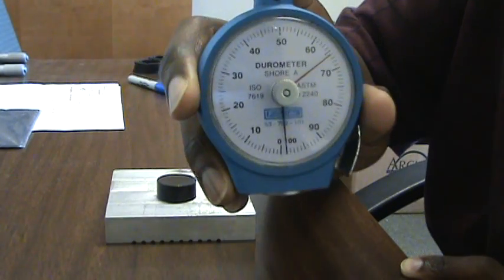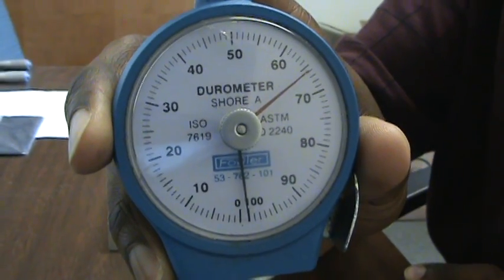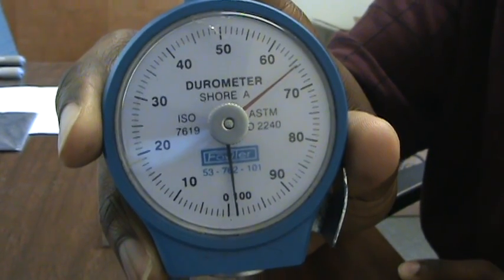The red dial indicates what the durometer is reading on the scale. In this case, you can see that the durometer is reading at 66 or 67.